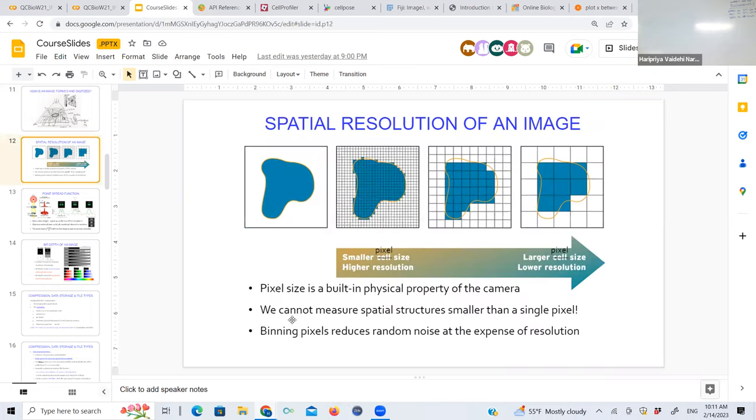Let's go a little deeper into spatial resolution. Sorry, on the 12 megapixel example, 4x3, what are the units? It's 4K pixels by 3K pixels on each side. Now, a pixel can have a physical dimension. For example, on a lot of CCD devices, the size of a single pixel is 6.5 microns by 6.5 microns. But that means nothing to you in effect when you're capturing something from far away, because you really care about the number of pixels and what you're dividing that size over.